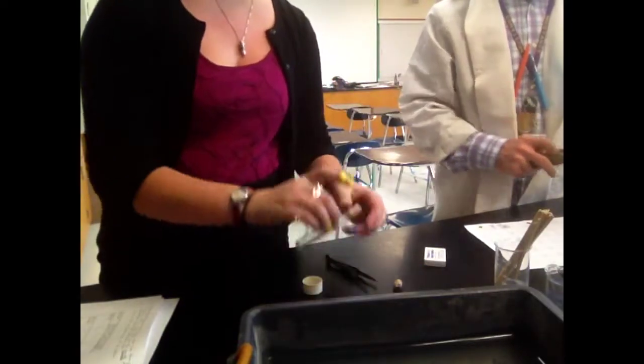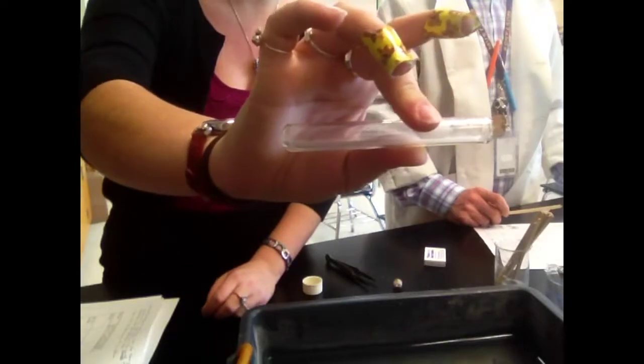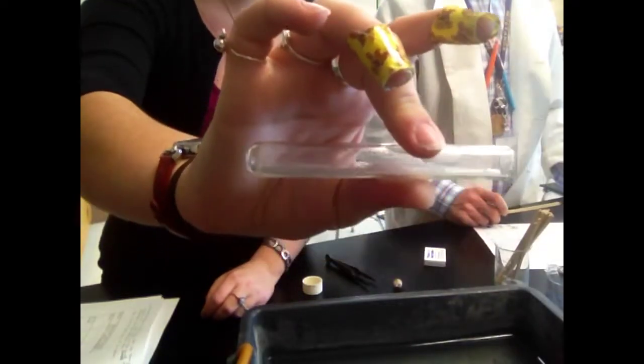Our final test tube had that 1/12 acetylene gas in it, and so then there's 11/12 of air. You're going to open this up, pop it, right? So that loud pop sound, there's no soot, meaning that there was a combustion reaction, no incomplete combustion here, and we see no soot. So you're going to write your observations down, the sound you heard, and what observations you can visually see.